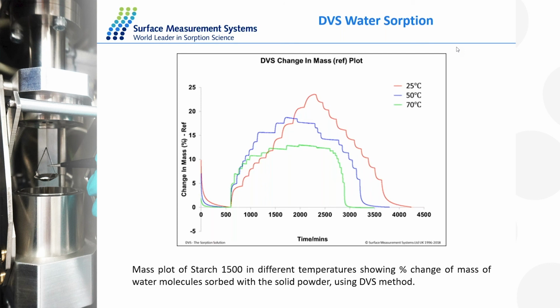Well, thank you. That is a really great explanation, Majid, and thank you for sharing the question. I have one follow-up question. Where do you see evaporative cooling more, and where do you see the pronounced effect? Which are the ranges, or which humidity cycle, where you start to see the evaporative cooling effect?